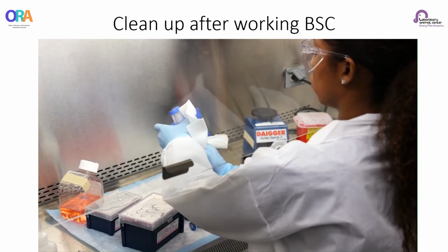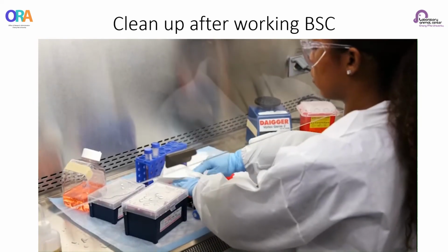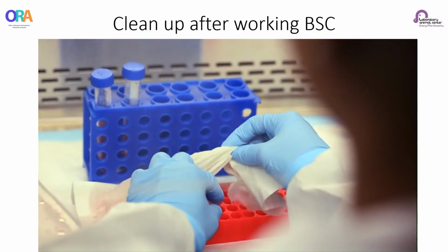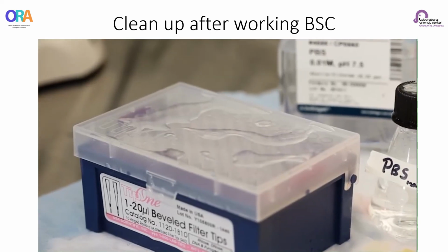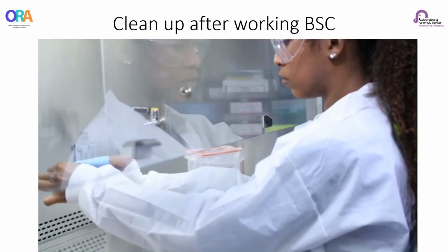Please note, samples should be surface decontaminated or placed into secondary containers that have been surface decontaminated prior to exiting the cabinet. Please allow materials to remain wetted for the appropriate amount of contact time.